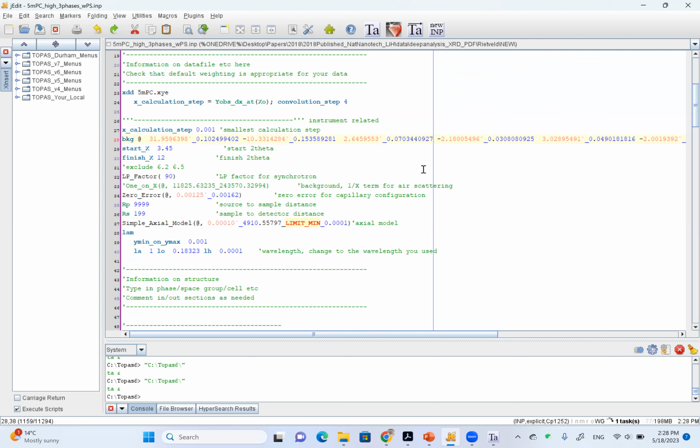And this is different from AMC, because in AMC, your background looks like almost a straight line, right? And also because the background is so small compared with the peak, no matter how it varies, it's not really doing anything to a peak. Your peak is still mostly your peak, and your background is just doing a very limited influence on the peak. But here, an interface sample is different.